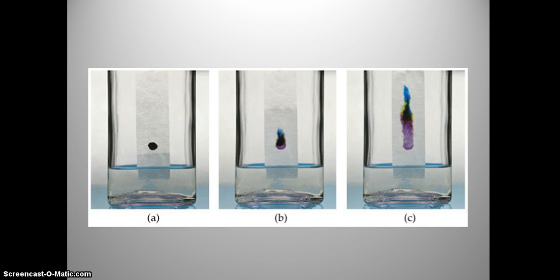Here's an example of what you're going to be doing today or in the lab tomorrow. You're going to take an ink sample that looks like the sample here on the left and place it in the solvent, which is alcohol. Over time, you can see the solvent front, and the chemicals are starting to separate and travel. Once your solvent reaches within about a centimeter of the top of the paper, it is finished and you're going to pull it out.